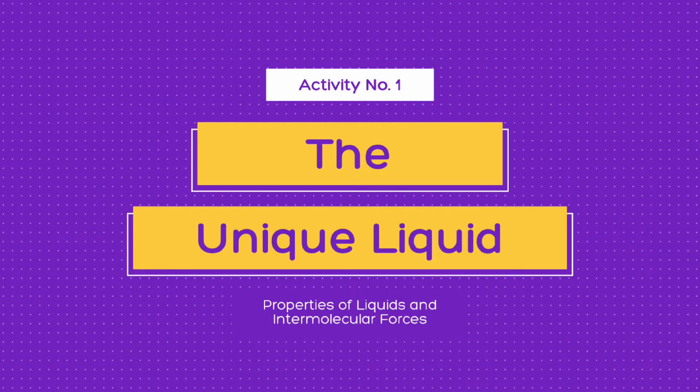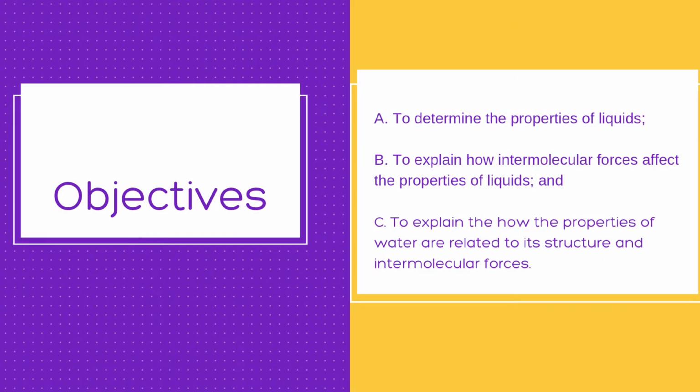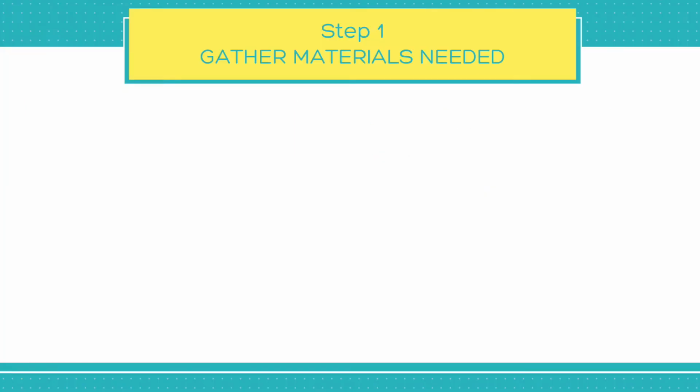Activity number 1. The unique liquid. Objectives: to determine the properties of liquids, to explain how intermolecular forces affect the properties of liquids, and to explain how the properties of water are related to its structure and intermolecular forces. Step 1. Gather materials needed.